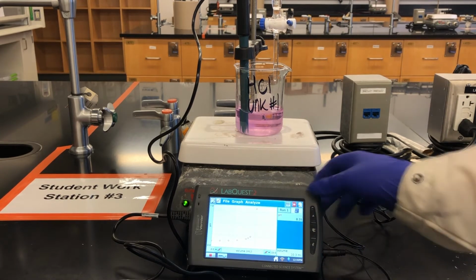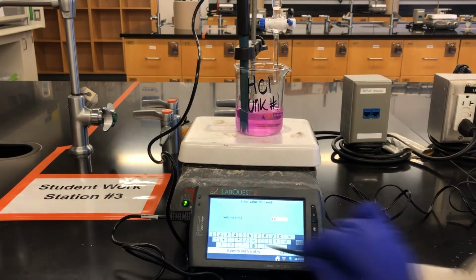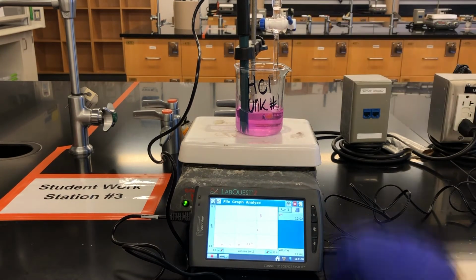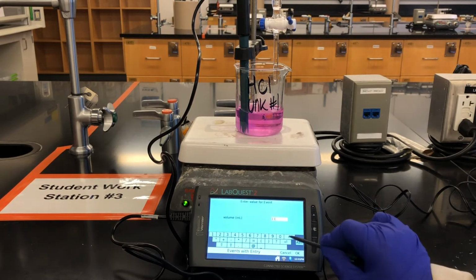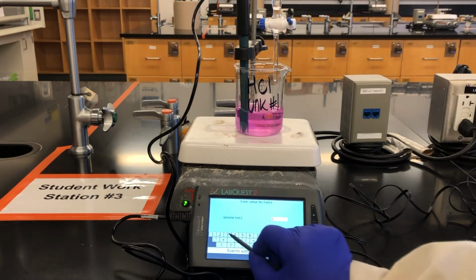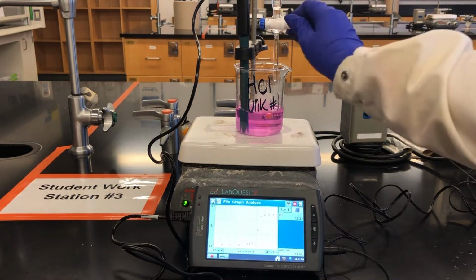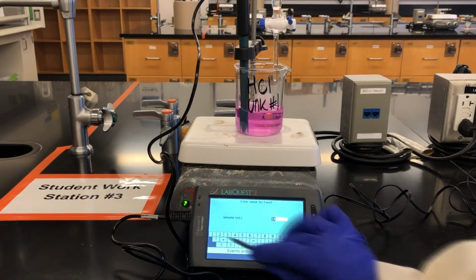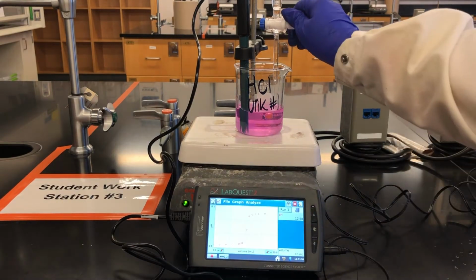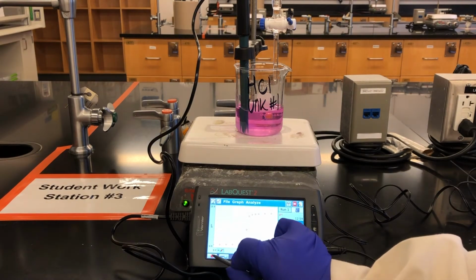After reaching the endpoint, we add 2 half milliliter portions, followed by 2 1 milliliter portions, and then another 2 2 milliliter portions of titrant. This end of the curve is to ensure that we have enough data points for calculating the second derivative curve. Once finishing the titration, the pH probe is removed, rinsed with water, and then properly stored. The reaction mixture is disposed of in a waste beaker, and now that our titration is complete, we can move on to Part B.